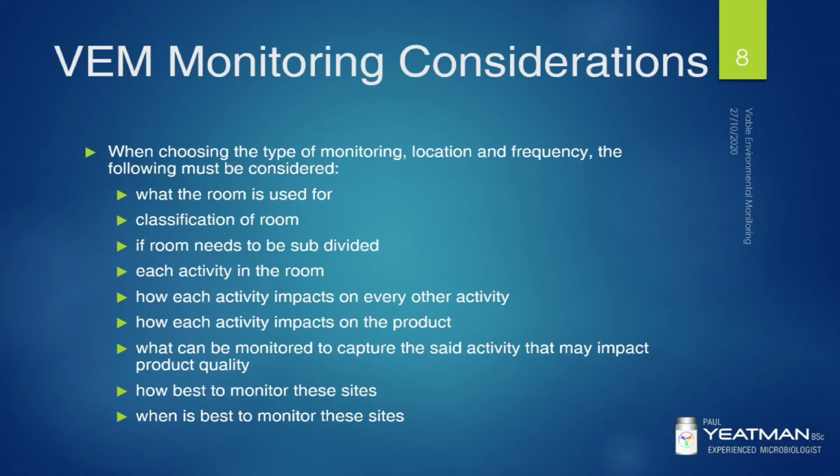For a sterile product, air and product contact surfaces are considered more critical than non-product contact surfaces and thus have to be monitored. This may also extend to personnel, equipment used to manufacture product, containers, gas lines, stands, walls, whatever. Particle counting may also be required, as well as regular dummy runs using sterile media in place of actual product, the good old aseptic media fill.